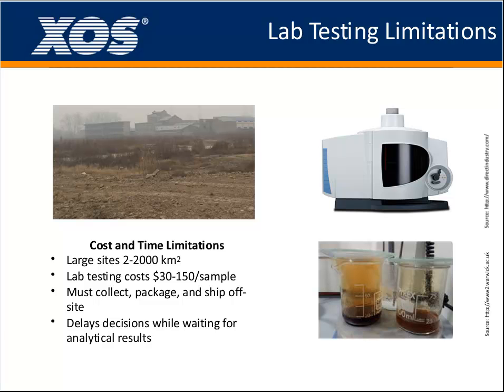so that it is very time consuming and costs money, and it can be a problem for a large investigation or remediation site because the area is too large, and we cannot ship all the samples to the laboratory. If we do so, we are wasting too much time and money and delaying decisions while awaiting the analytical results, especially for contamination source identification. Generally, portable XRF is very useful for such applications because it is quite easy and it can analyze the boundary of the contamination source easily, and that's the best advantage.